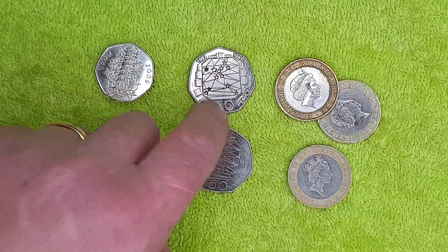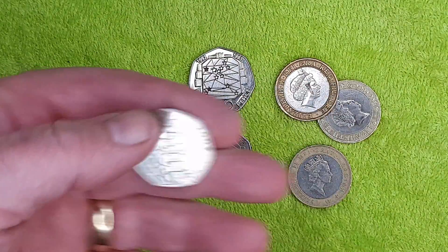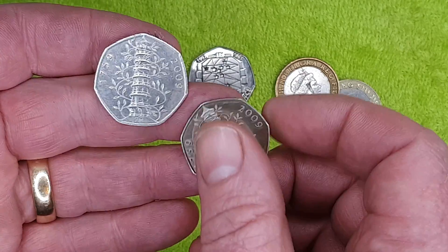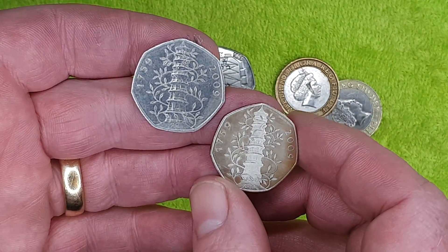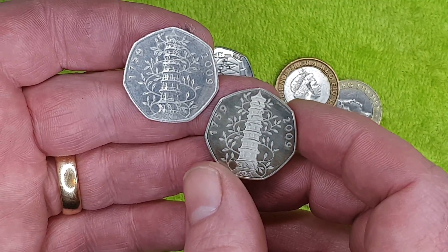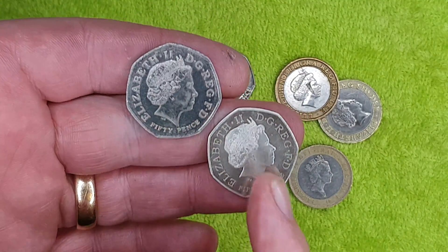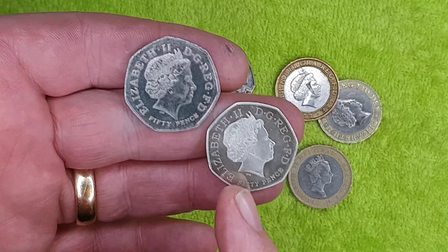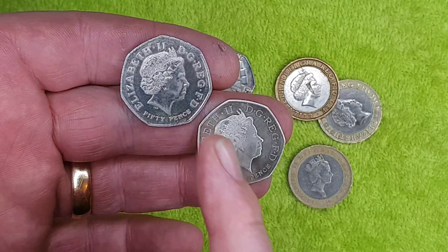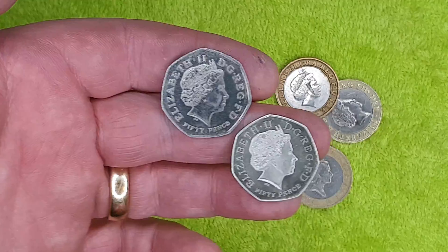The first thing we can do is just look at them. Getting the genuine Kew Gardens next to the fake, you can see there's a lot of difference. Especially when you look at the other side. I'm not going to point out all the fakery details here — there are plenty of videos out there that do that — but we are going to measure these, weigh these, and zap them with x-rays.